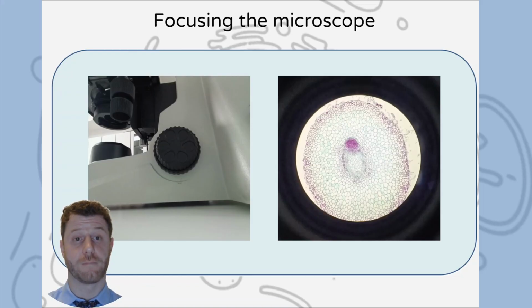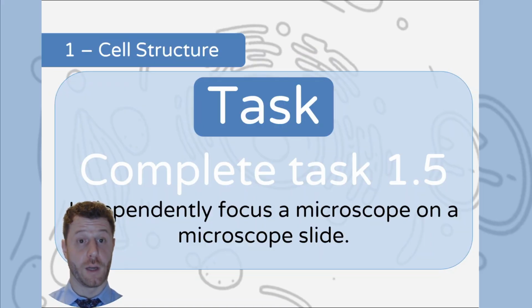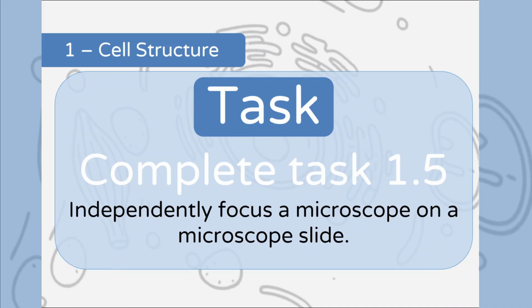access to a microscope. If you are following along with my course, or even if you're just studying on your own, make sure that you do take a break to practice independently focusing a microscope on a microscope slide. This part isn't something that you can do theoretically, and it is really something that you're going to have to do in your Cambridge exam.